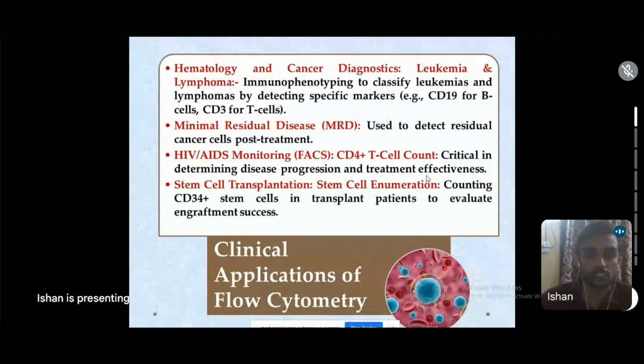Now, stem cell transplantation. What is it about stem cells? Nowadays, it's all about stem cells and transplantation. We are conducting lots of studies for cellular transplantation, tissue transplant, even organ transplantation, blood transplantation. So flow cytometric analysis is very important in transplantation immunology and immunogenetics. This is a field which uses flow cytometry as a major instrument for its analysis. The transplant can be a cellular transplant, a tissue transplant, an organ transplant, or a blood transplant.